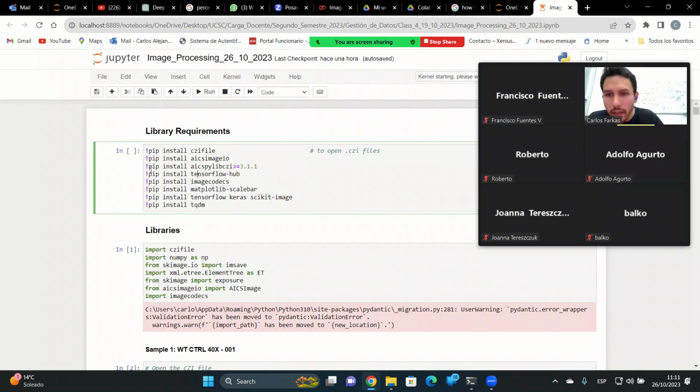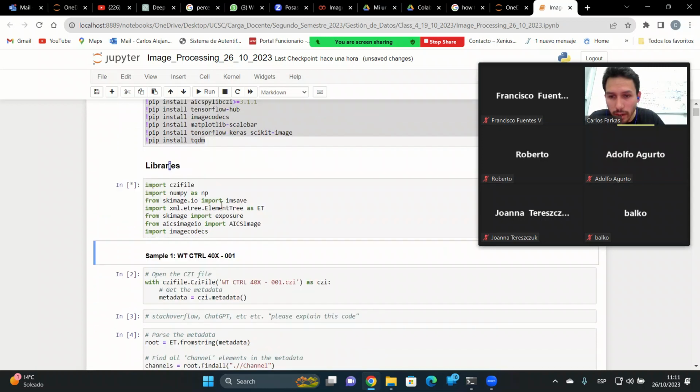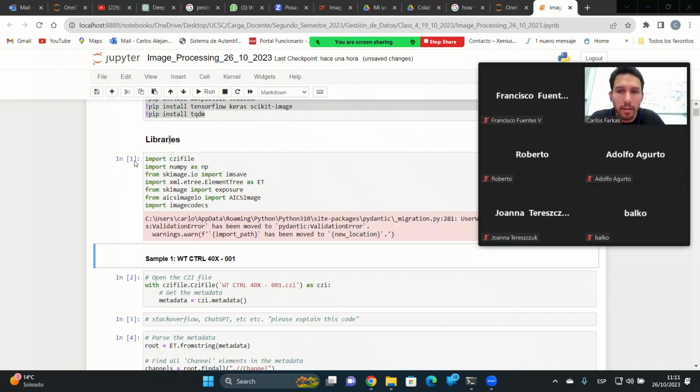I have everything here. If you are working on Jupyter Notebook, I do not have to run this install again. If you run it just once, it's okay, with warnings but without errors. Okay, so I would just go straight to importing the libraries. So I'm expecting to have a log here, which is okay. So basically, just a single warning here.